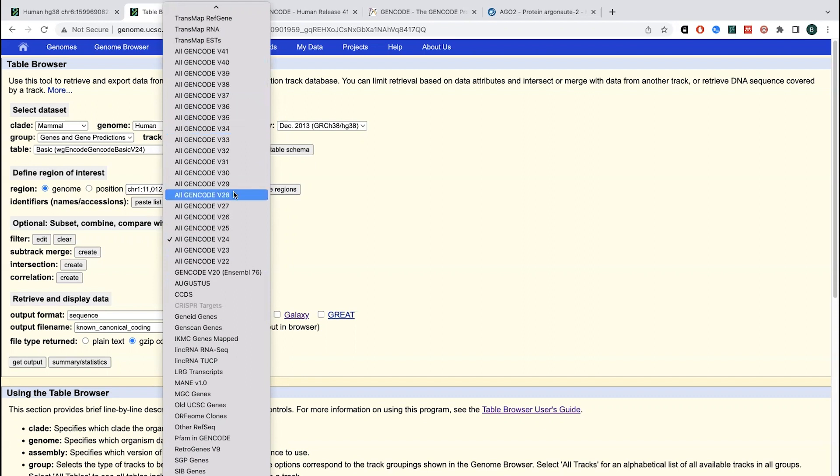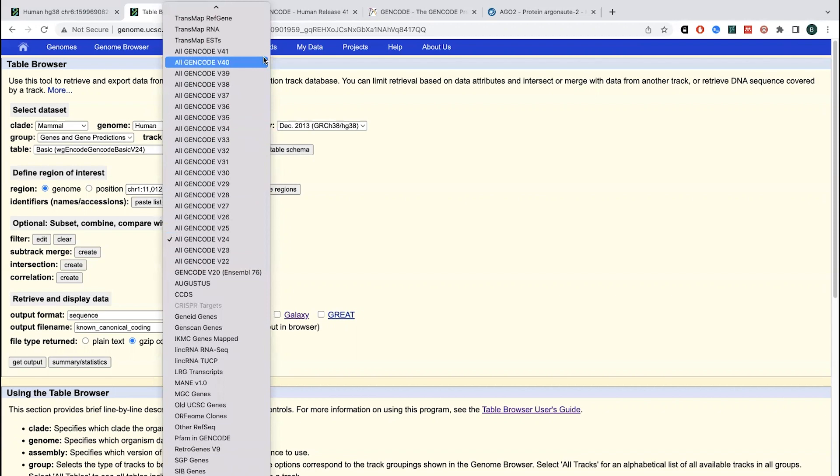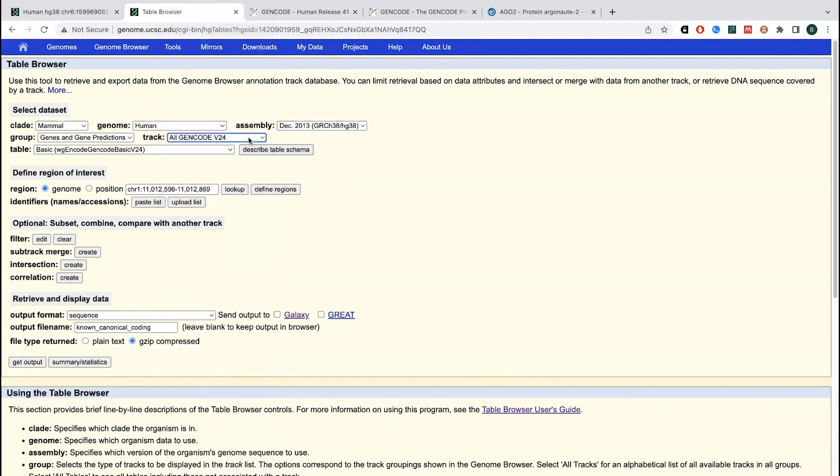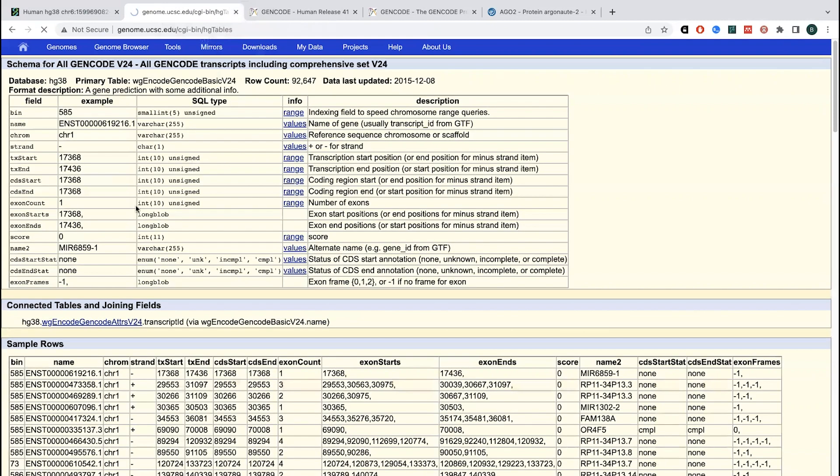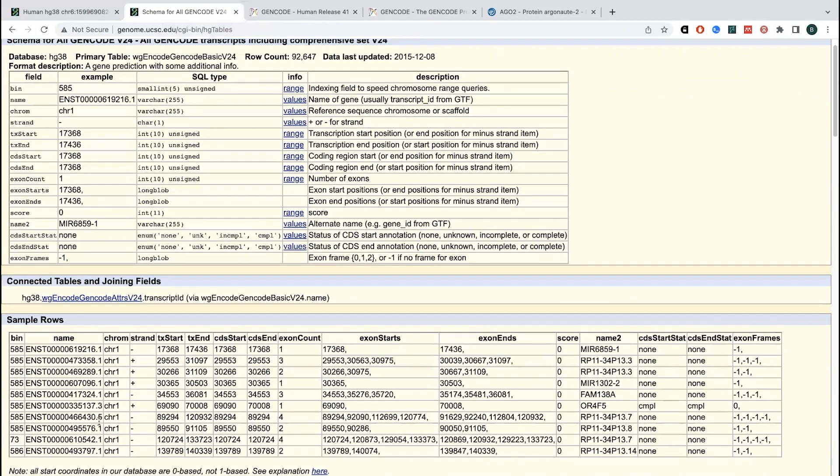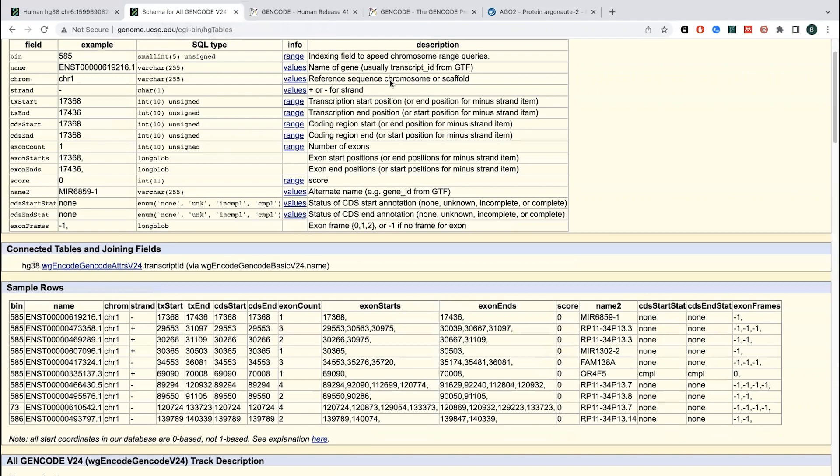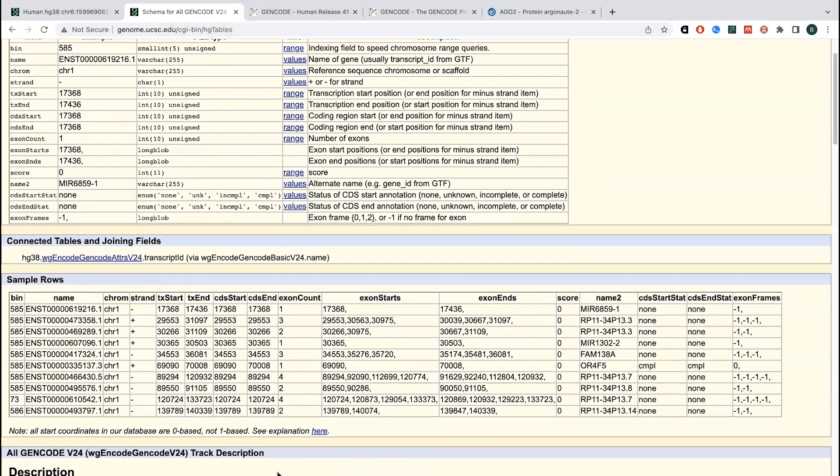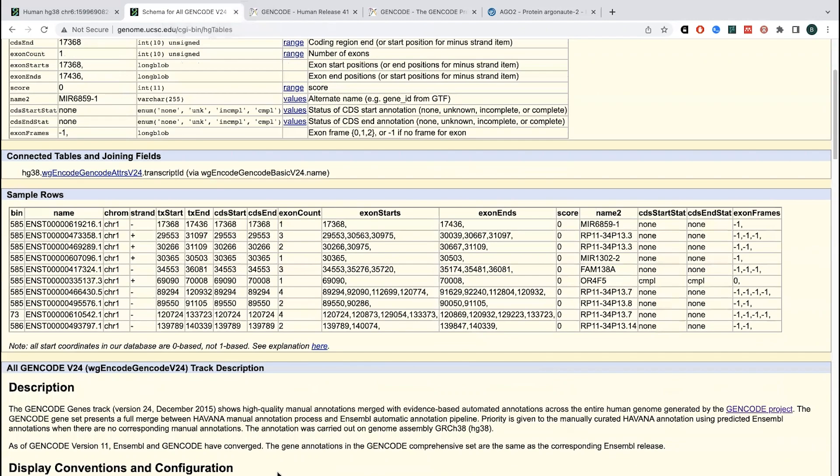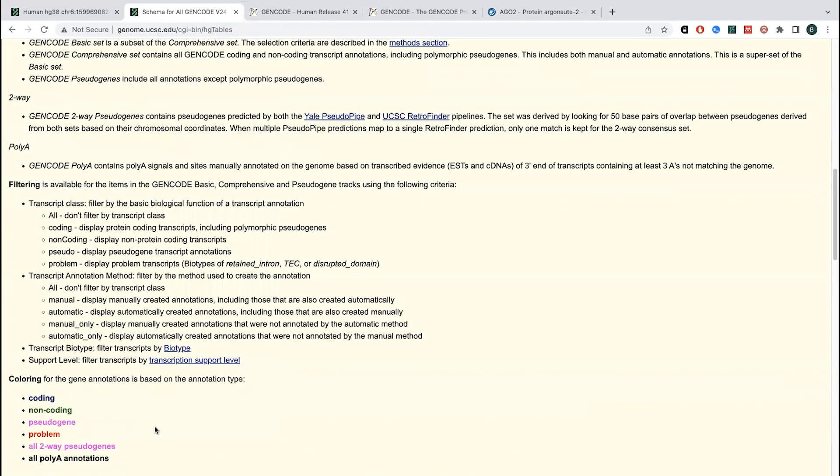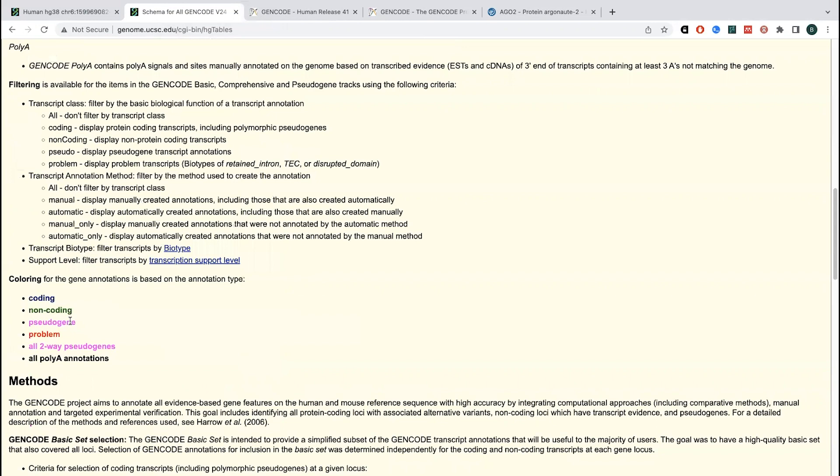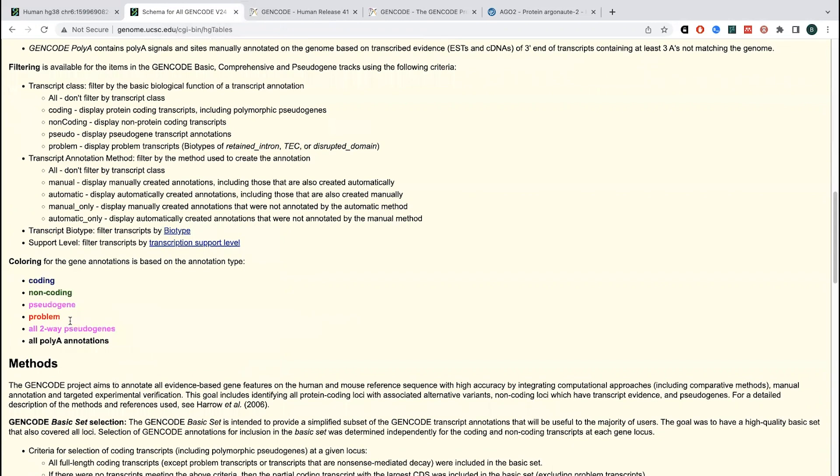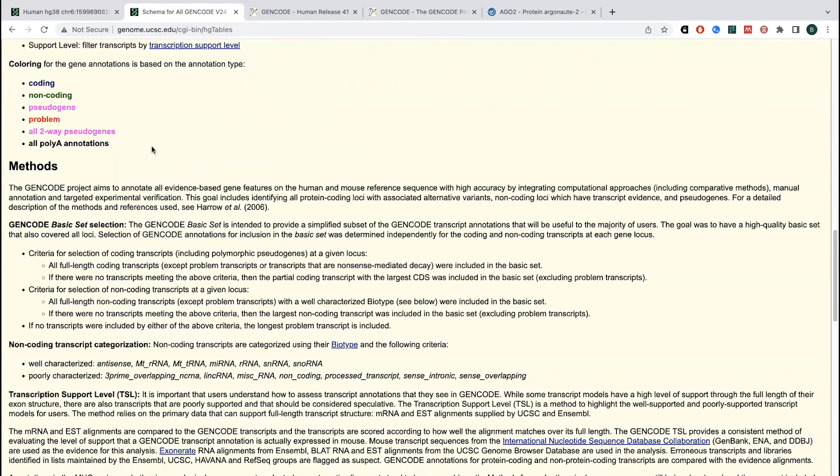And so different papers will say, okay, I used version 24 or I used version 41, et cetera. So that is one thing that you can do here. You can also then further filter things out if you wanted to, get filter out by various things like exclude pseudogenes or whatever. There's various different things that you can do.